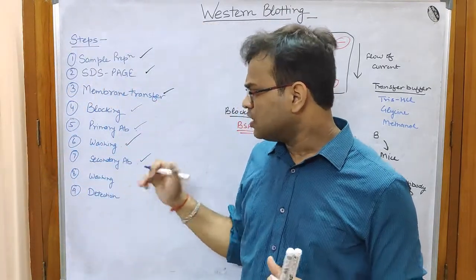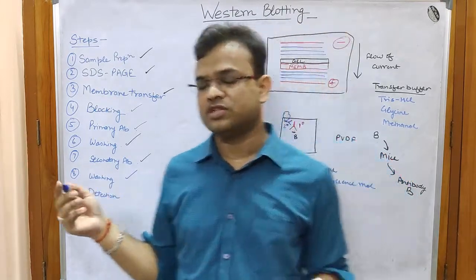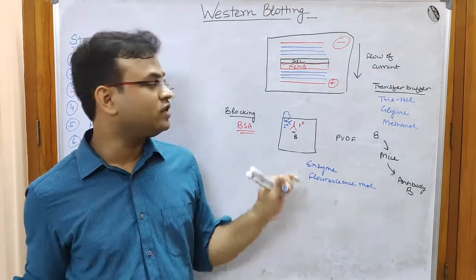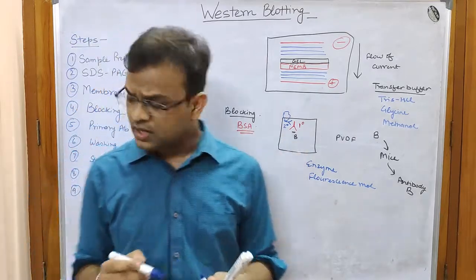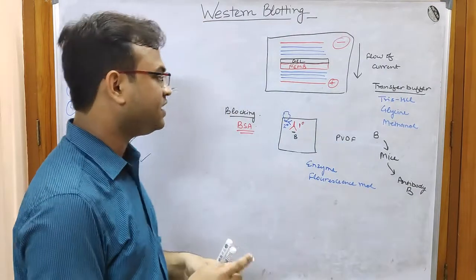Okay, now coming to washing, the reason for washing would be the same: non-specific binding would be removed and only secondary antibodies that have bound with the primary antibody would be present over here. Okay, now coming to detection. Let us understand detection.